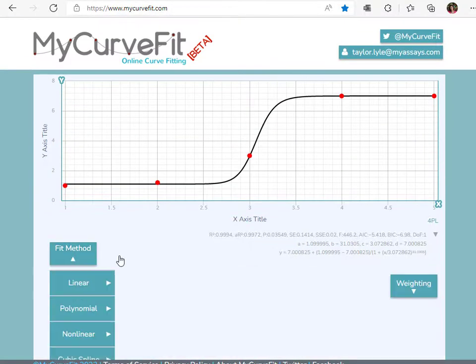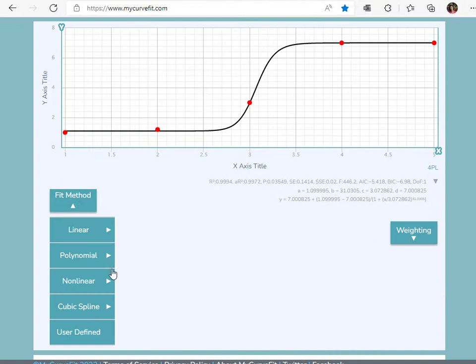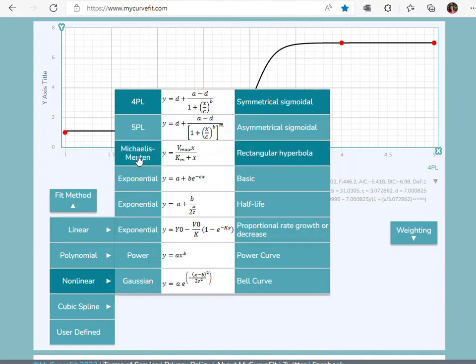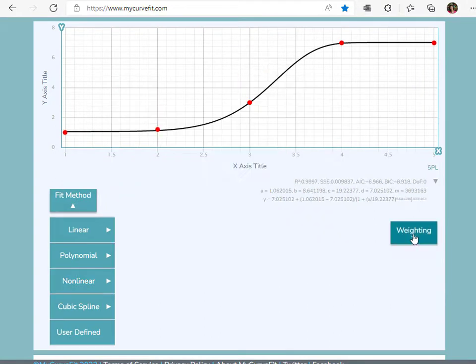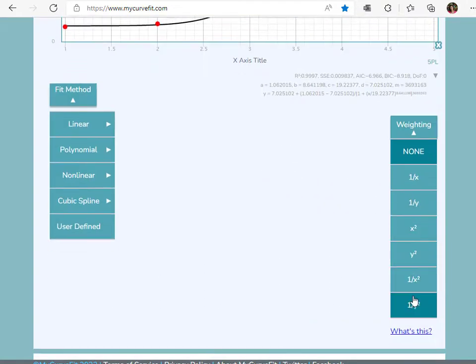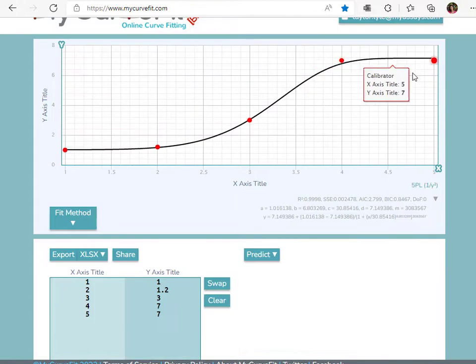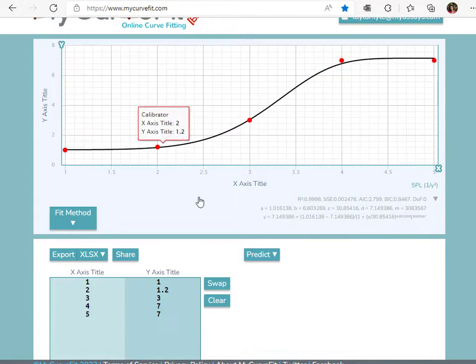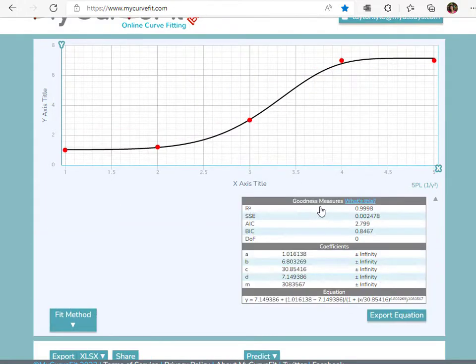Select the fit method and weighting model, and the chart is automatically updated. The coefficients, equation, and goodness measures, including R squared, are listed here.